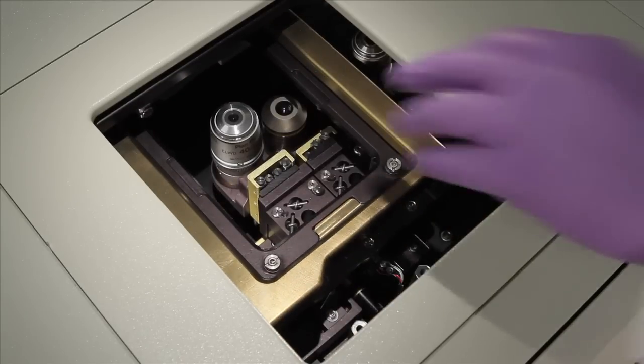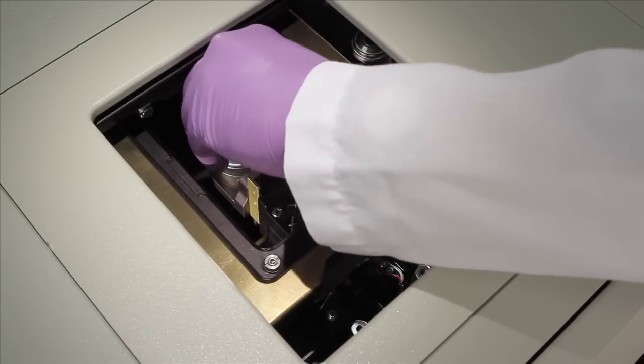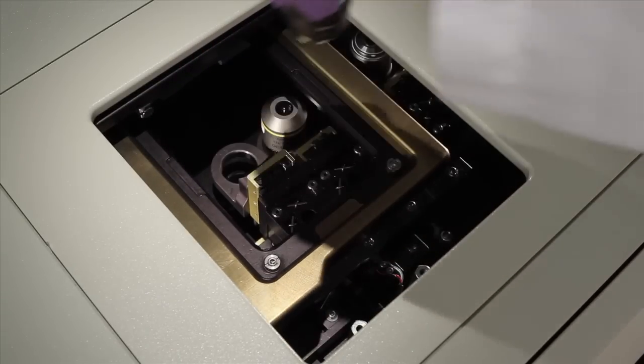If the objective is not accessible from the side, it can be adjusted by accessing it through the sample door.